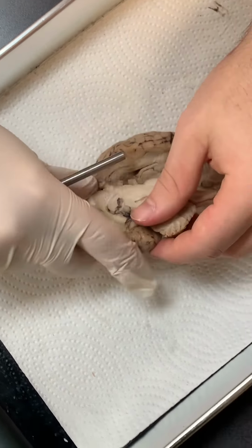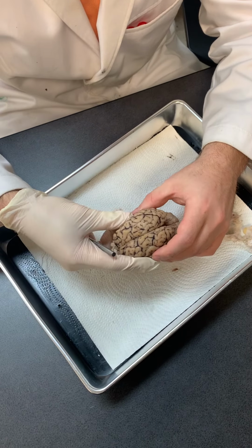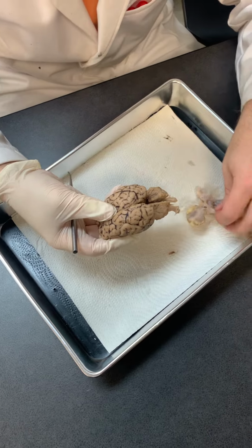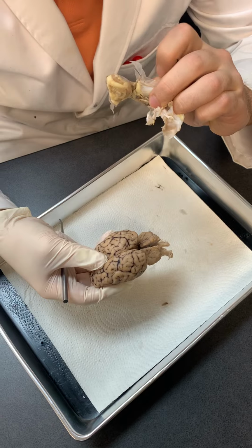Okay? If we go ahead and look at the, well, I guess we might as well do the covering. Before we move on to the cranial nerves, we have a covering, right? This durable, leathery covering is going to be the most prominent layer of what we call the meninges. The meninges is all of the coverings that surround the brain. And if you guys remember dissecting it, it had like a white leather layer on top of it. And that outermost layer, which you can see little bits of still attached to the skull, this leathery stuff here, that is called the dura mater.